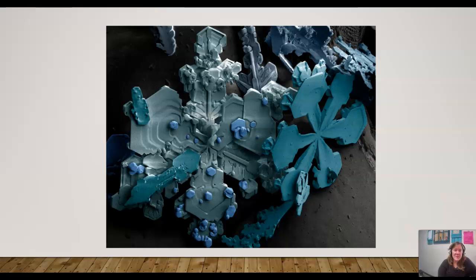Okay, what's this one? This is number 2. Okay, looks pretty epic, honestly. So hopefully you wrote down your guess. These are snowflakes. They've been sprayed with that light metal coating so they can be seen three-dimensionally under the scan of the electrons. But yeah, this is neat.